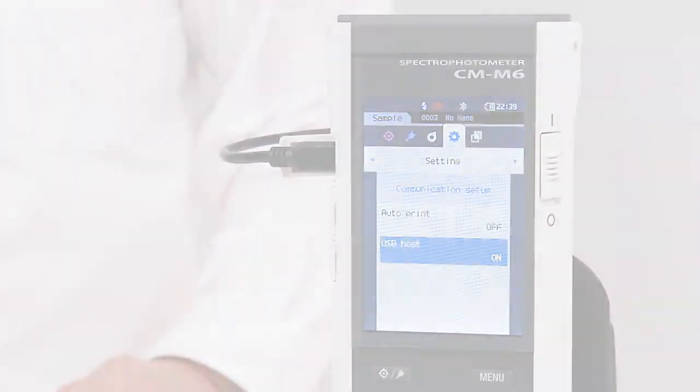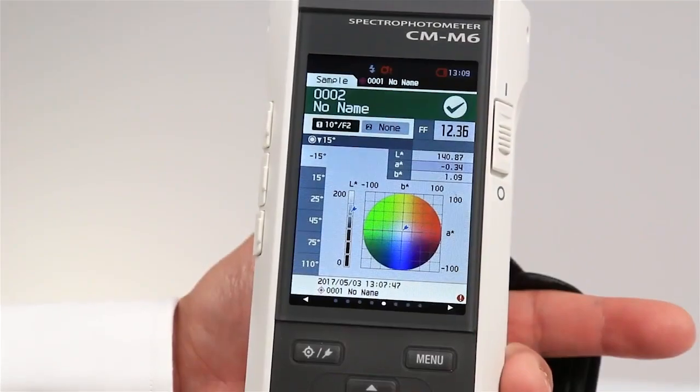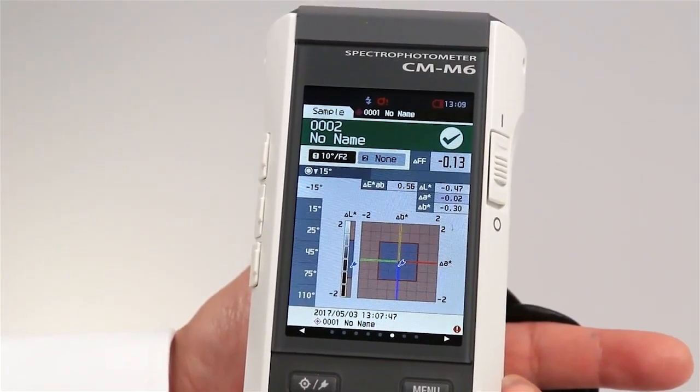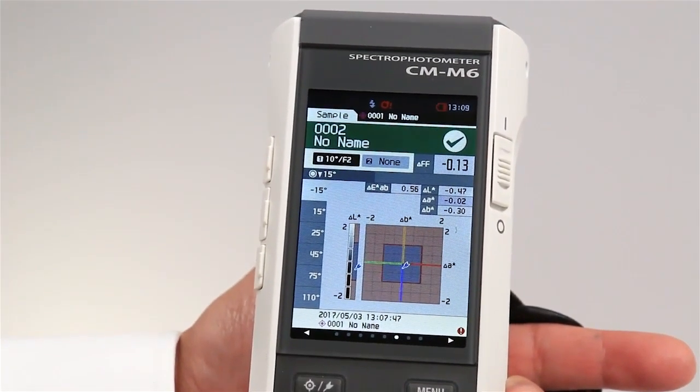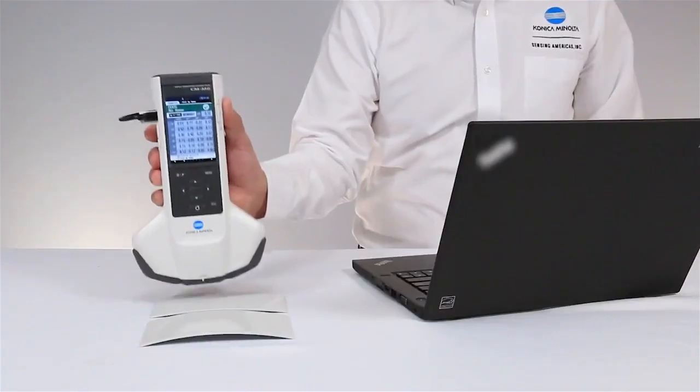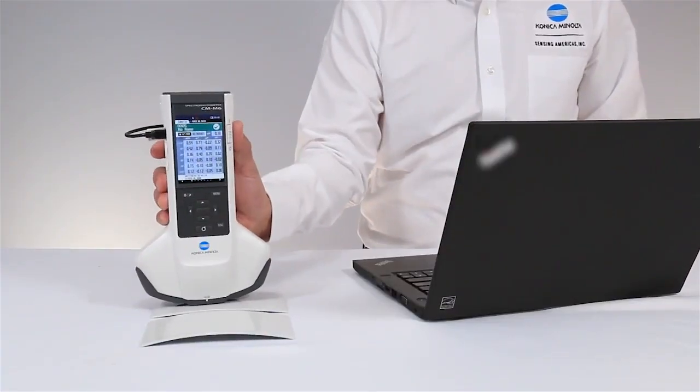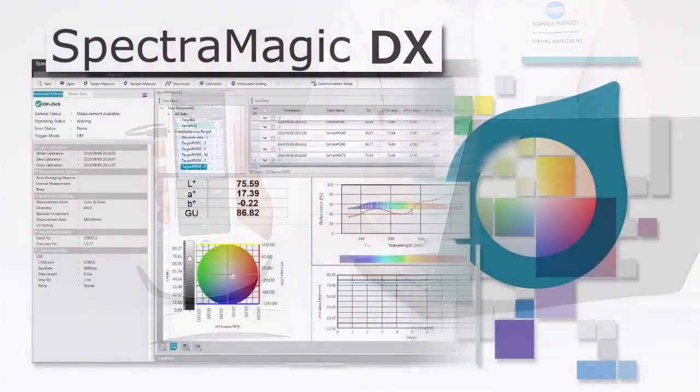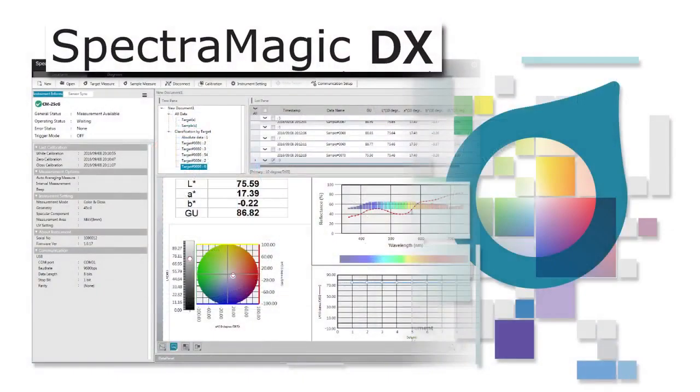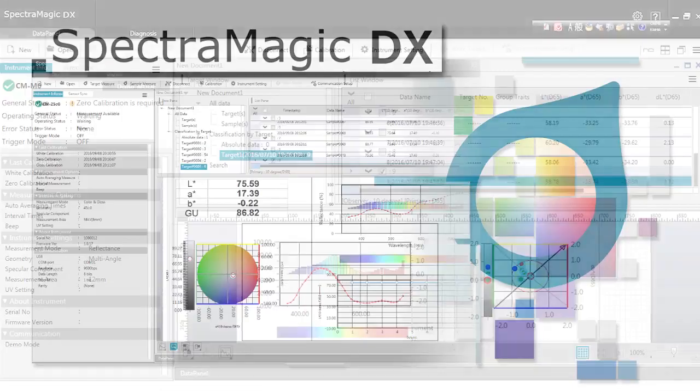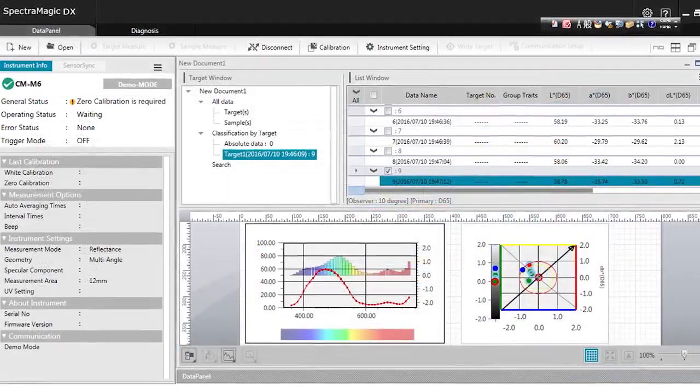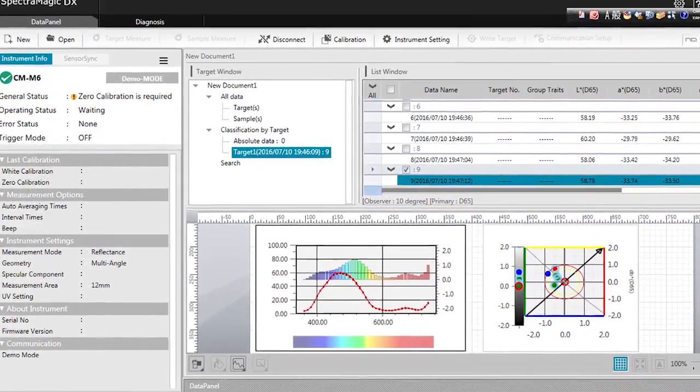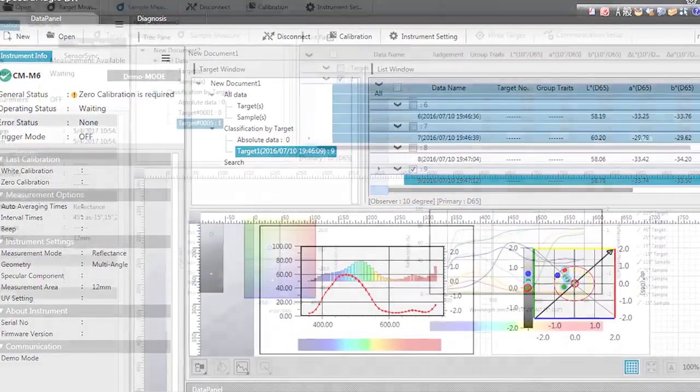A complete quality control system is possible with the instrument's standalone menu. Optional software SpectraMagic DX allows you to save, export, and print, as well as configure graphic and numerical layouts.